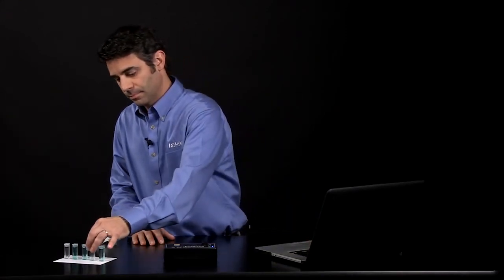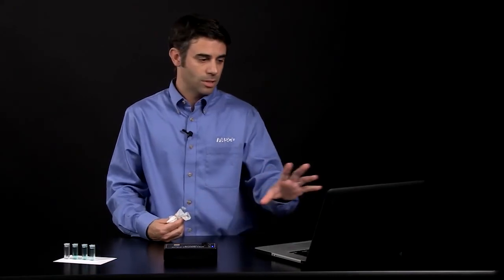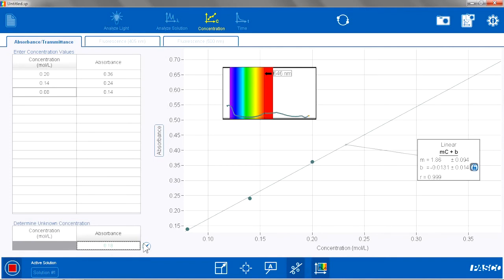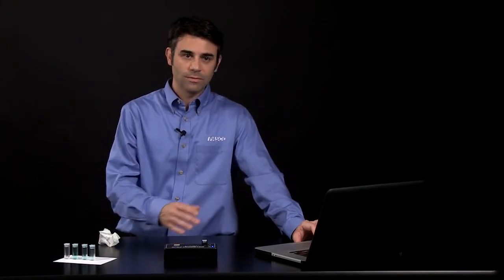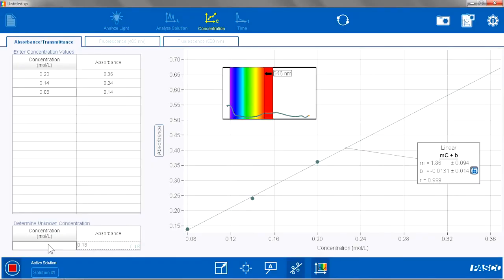Now that I have calibrated my standards, I can determine the concentration of an unknown based on its absorbance and the information that I have. This is where the software incorporates some pedagogy. I put my standard in, go down to the unknown concentration portion of this page, click in Absorbance, and hit Start. Now it is going to measure the absorbance of the unknown, and I am going to hit Keep. It does not tell the student what the value of the concentration is — it does not put it on the graph, but you can put it on the graph. The student has to figure it out first. Based on that absorbance, I can look at my data table and use the calculations of the slope and the intercept, or I can even use the graph to figure out what that unknown concentration would be. After I think about it, I assume the concentration is about 0.1.